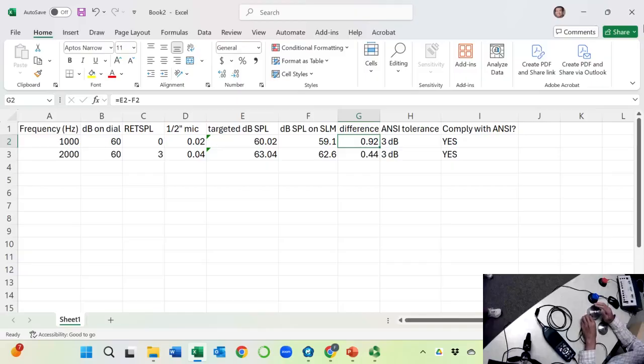Okay. I actually heard a little click because I'm very close. You probably won't hear it, but you can feel the click when you use your hand. Thread it in, and then make sure the dot is upright.